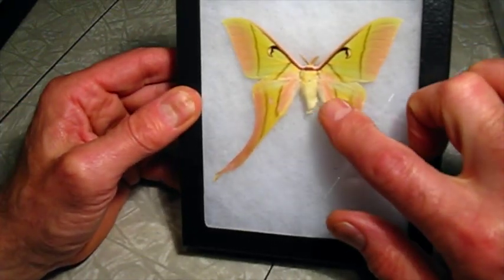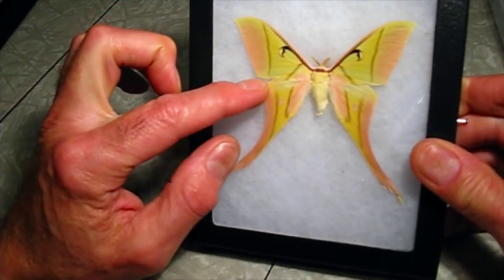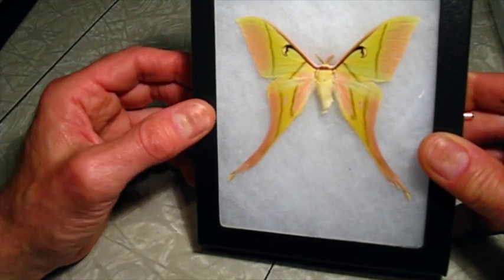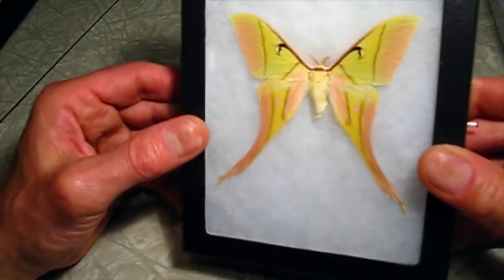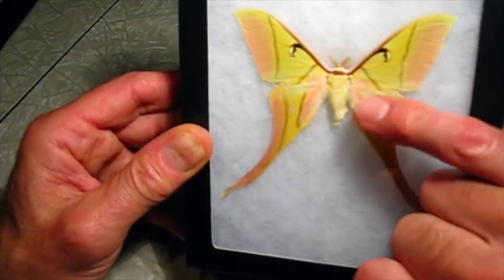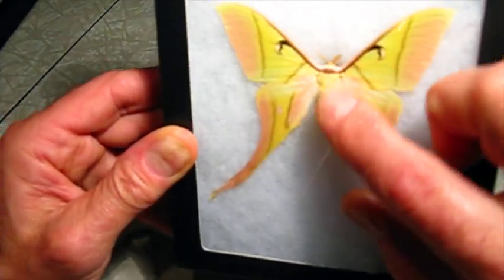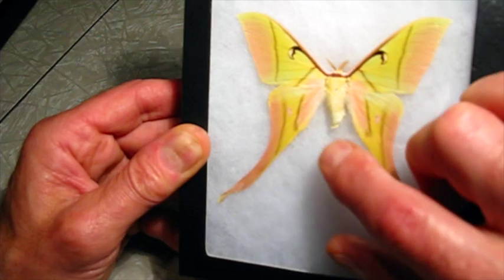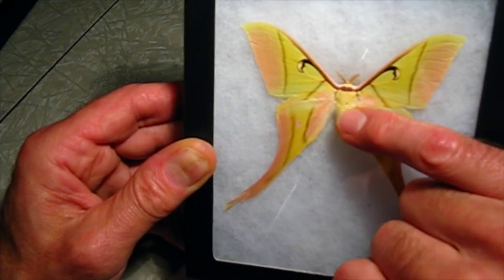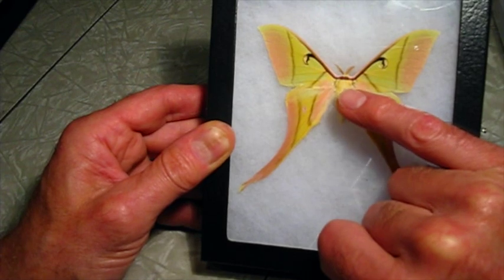It's not a bad mount, but there's a little more space between the wings than I prefer. I would have the hind wings just slightly lower, so I'm considering repositioning the wings. Now, this is risky because you always risk damaging the specimen. The bodies on these Saturnian moths are very furry, and this one is in really good condition — not smashed, the fur's not matted, it's all intact — and I'm going to have to put a pin through it.